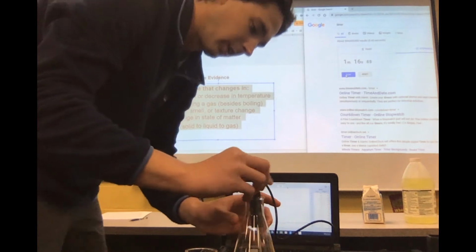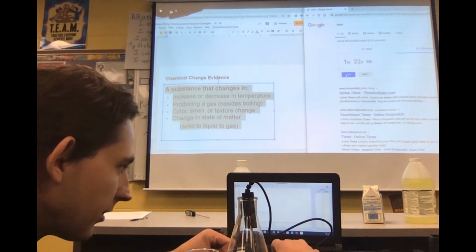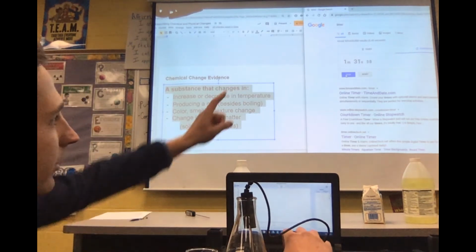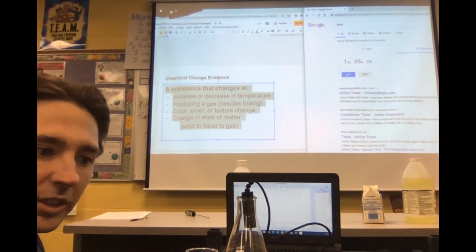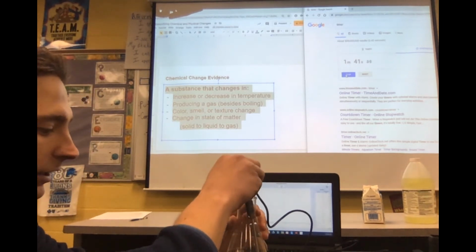And I'm going to start collecting the data for 5 minutes. It's at 1 minute and 30 seconds, so at 6 minutes and 30 seconds, we will be 5 minutes into the data.